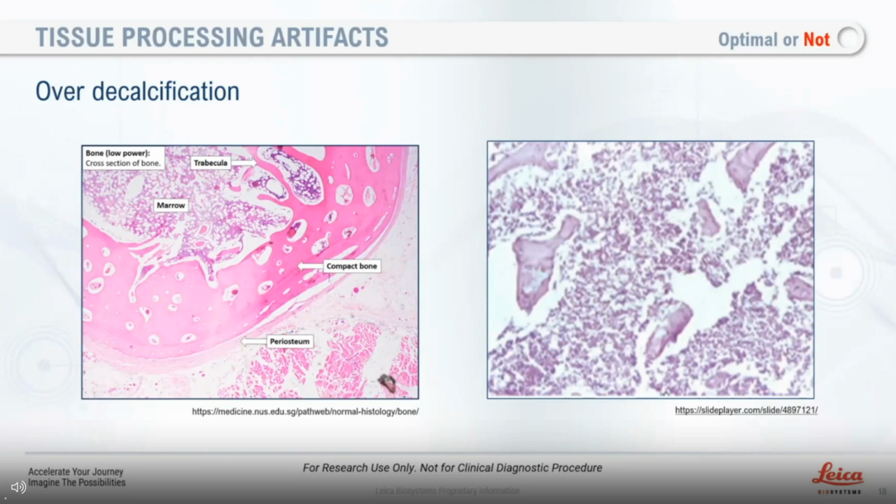Be aware that decalcification solutions, whether they're purchased or formulated in the lab, are harsh, usually acidic. So monitoring the process and the time needed to get to the endpoint where you can get a section is necessary, but being mindful of that time is important so that you not only have good histology when it comes to H&E, but that your IHC results are good too.